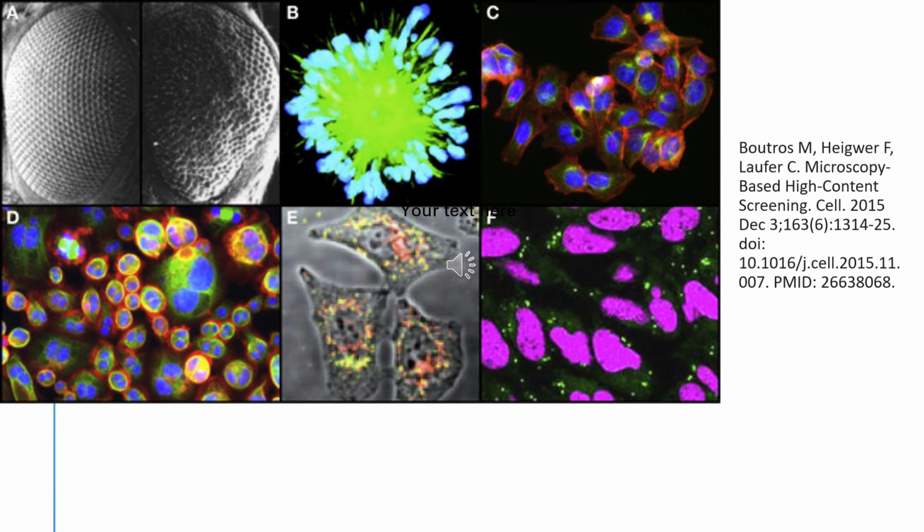In image C, it is HCT116 cells stained for DNA, alpha-tubulin, and actin to extract quantitative phenotypic features describing cell morphology. In D, it is Drosophila cells stained as in image C, with RNAi-mediated knockdown of Rho1, which led to enlarged multinucleated cells.